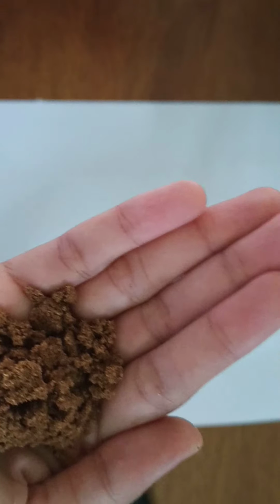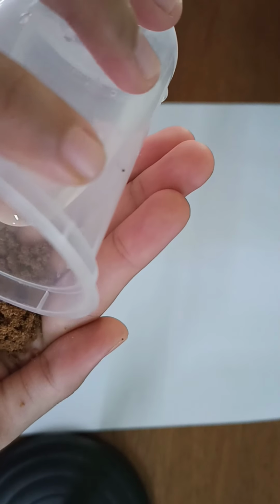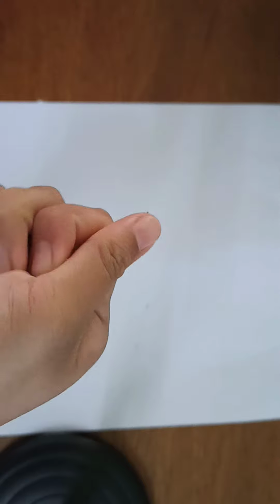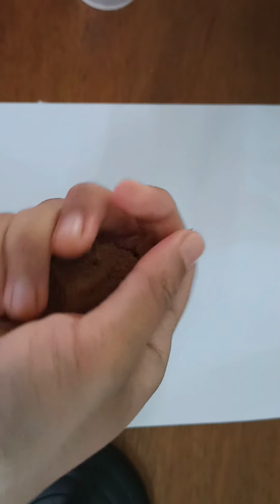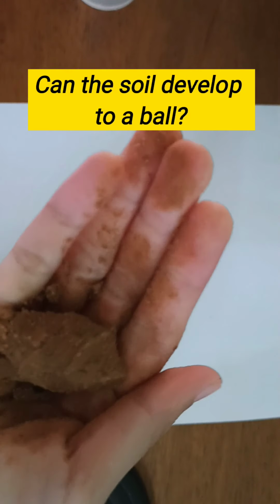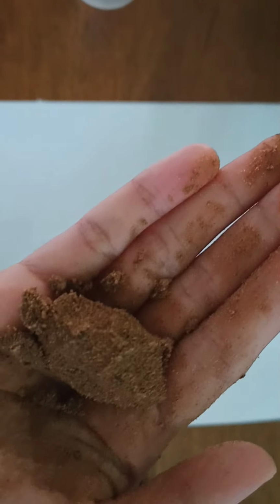So we are going to put a tablespoon of soil sample in your palm and drop a little bit of water. Okay, try to form a ball. Okay, can the sample form a ball?